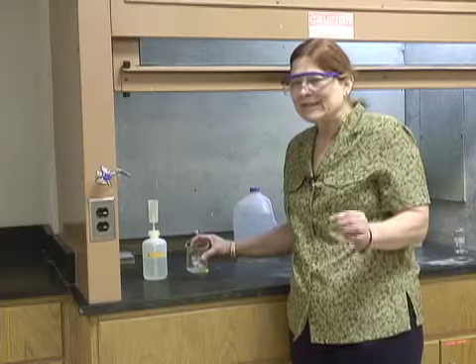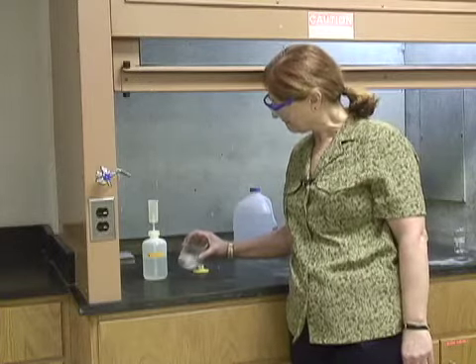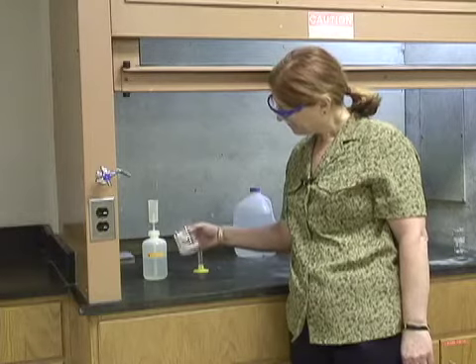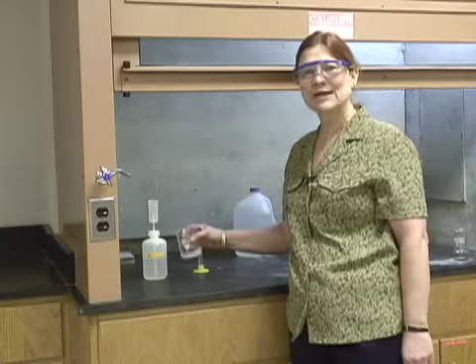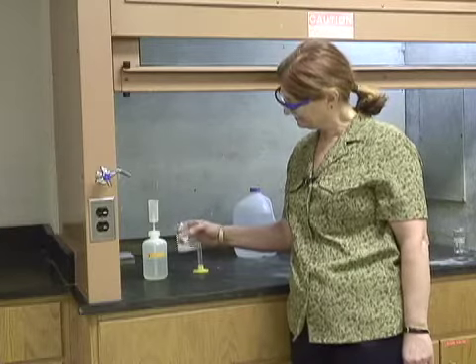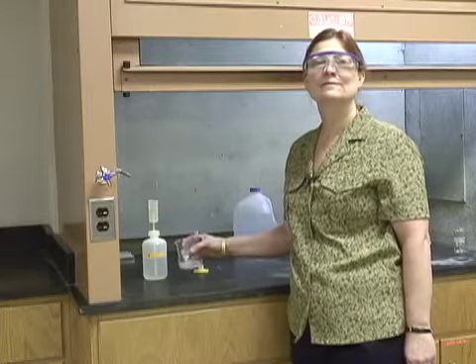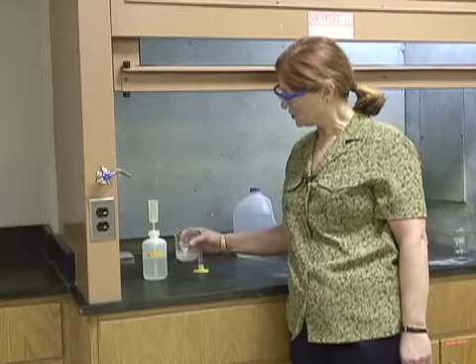The pieces are getting thinner and thinner, but they still look long in there. But you just have to be patient. Patience, patience. It's getting close. Just keep swirling. Get that reaction to go.